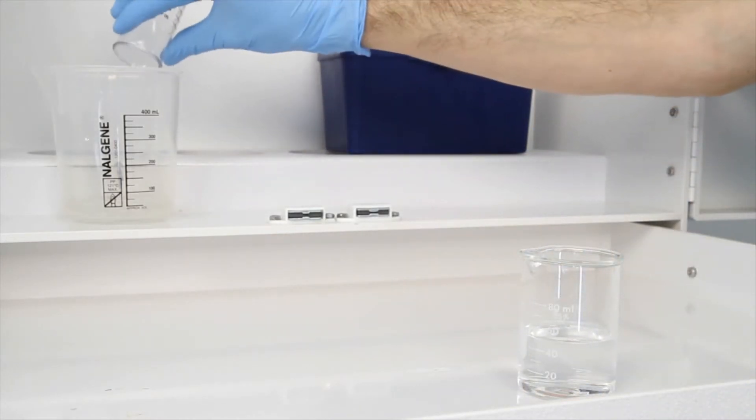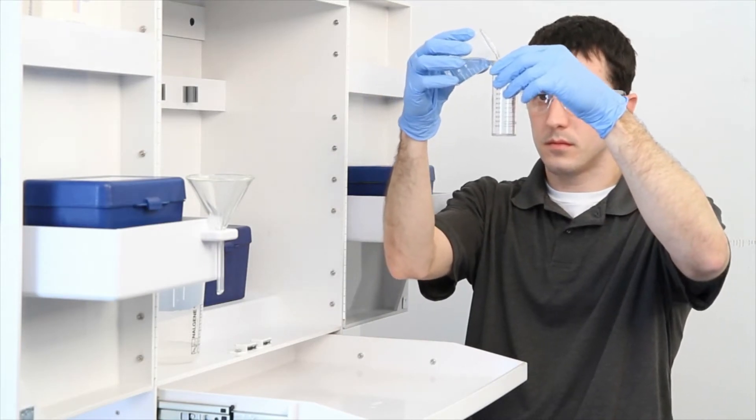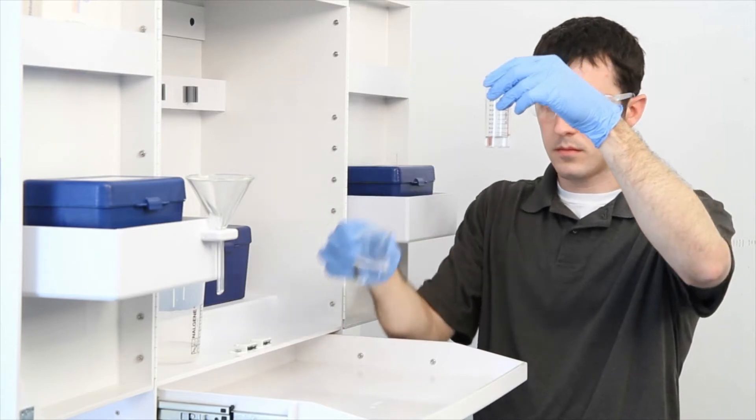To get an accurate sample size, hold the vial close to eye level. Once you feel you have an accurate sample, place the vial on a level surface and bend down to eye level.